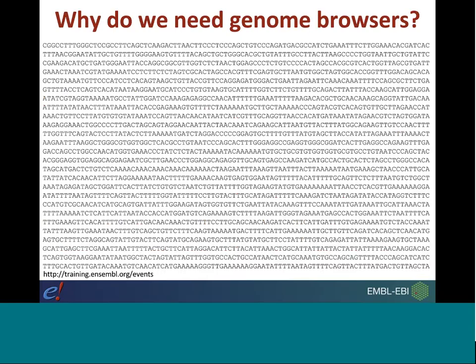Okay, so Ensembl is one of a number of different genome browsers that are available. It's freely available and it's based on the web, so you need to have an internet connection, but other than that, you don't need much else to begin browsing Ensembl. And we need Ensembl and the other genome browsers to try and make sense of all of the DNA sequence data that is currently being produced at an astonishing rate. So without any context and annotation, it doesn't really mean an awful lot.